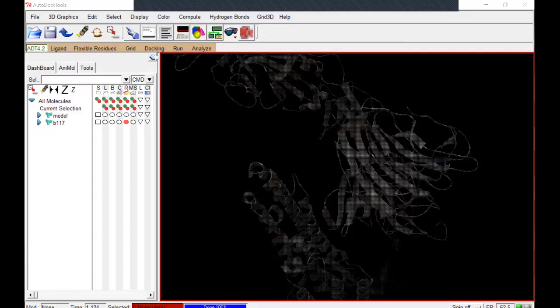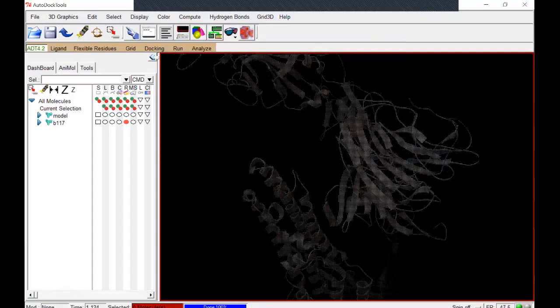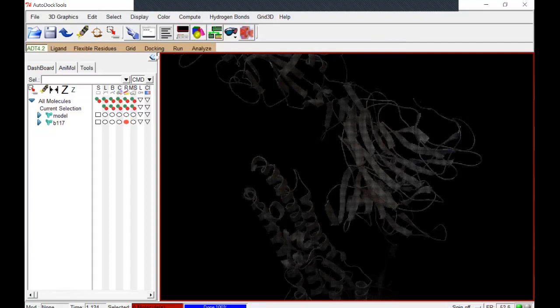Hello, this is Dr. Paul Cottrell, and I'm going to be talking about another three-dimensional protein structure that I created in Swiss model.